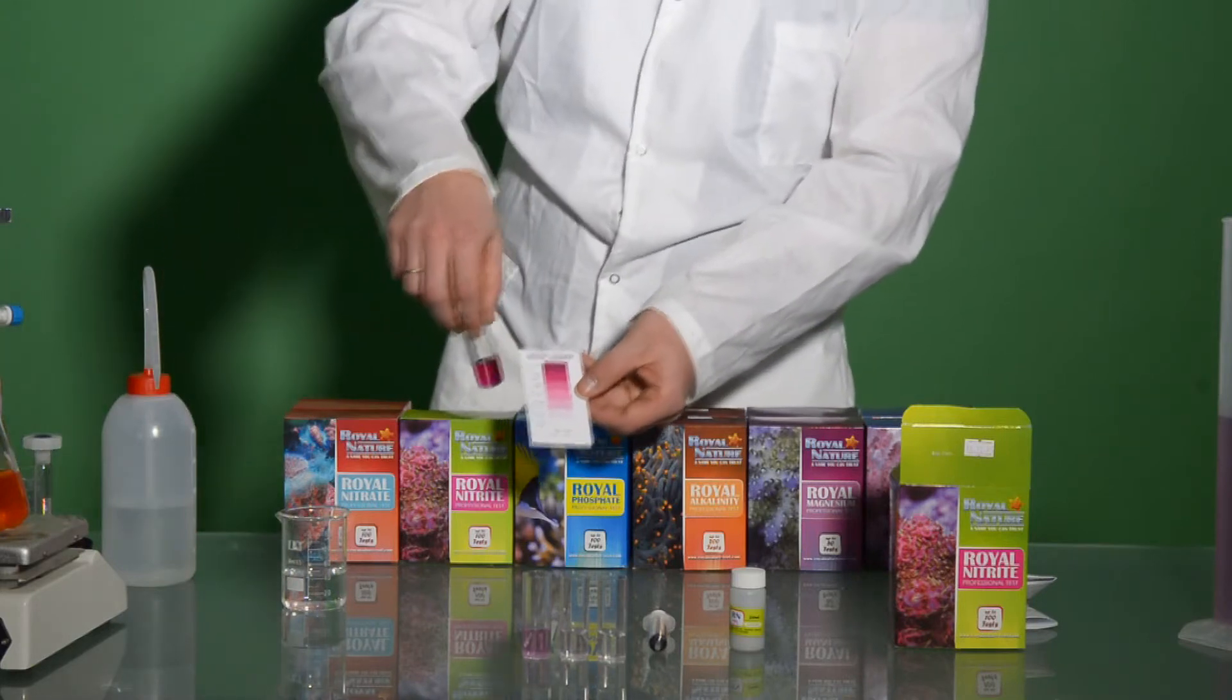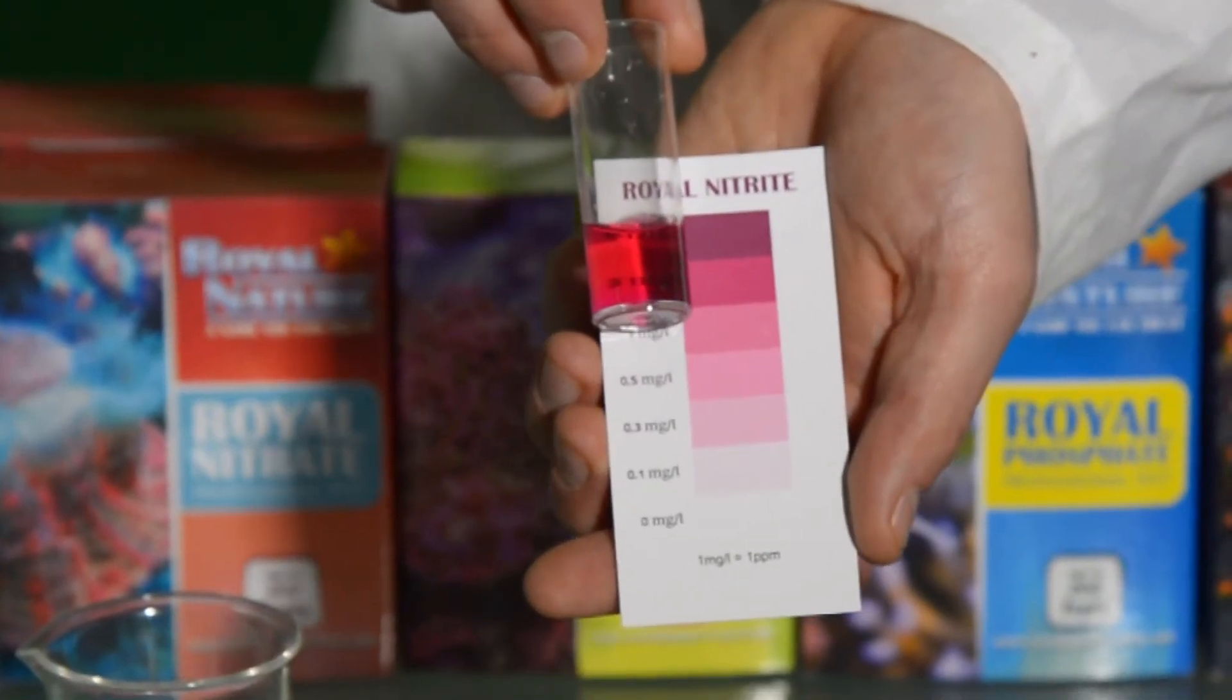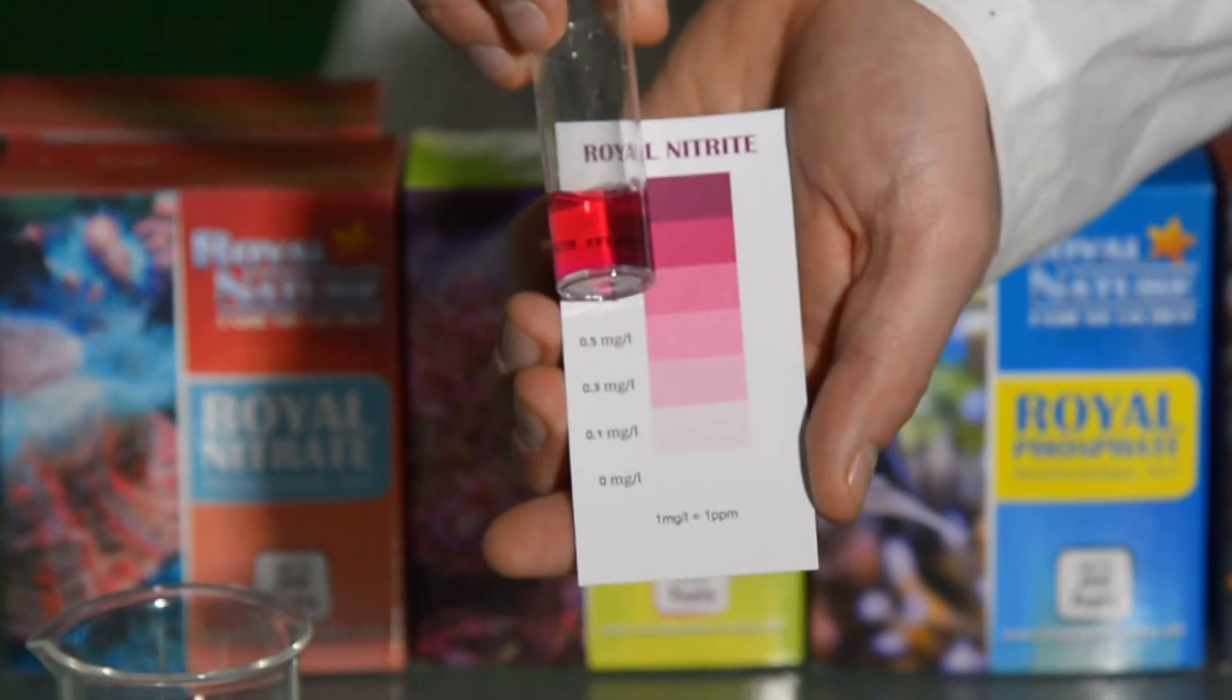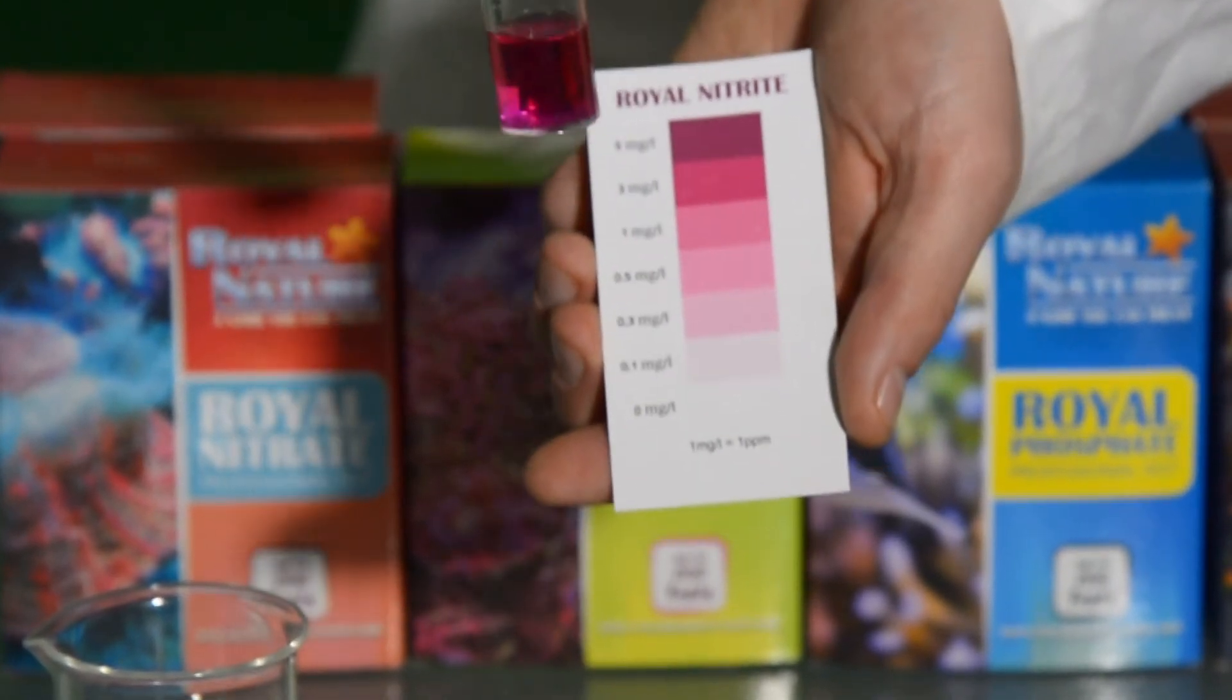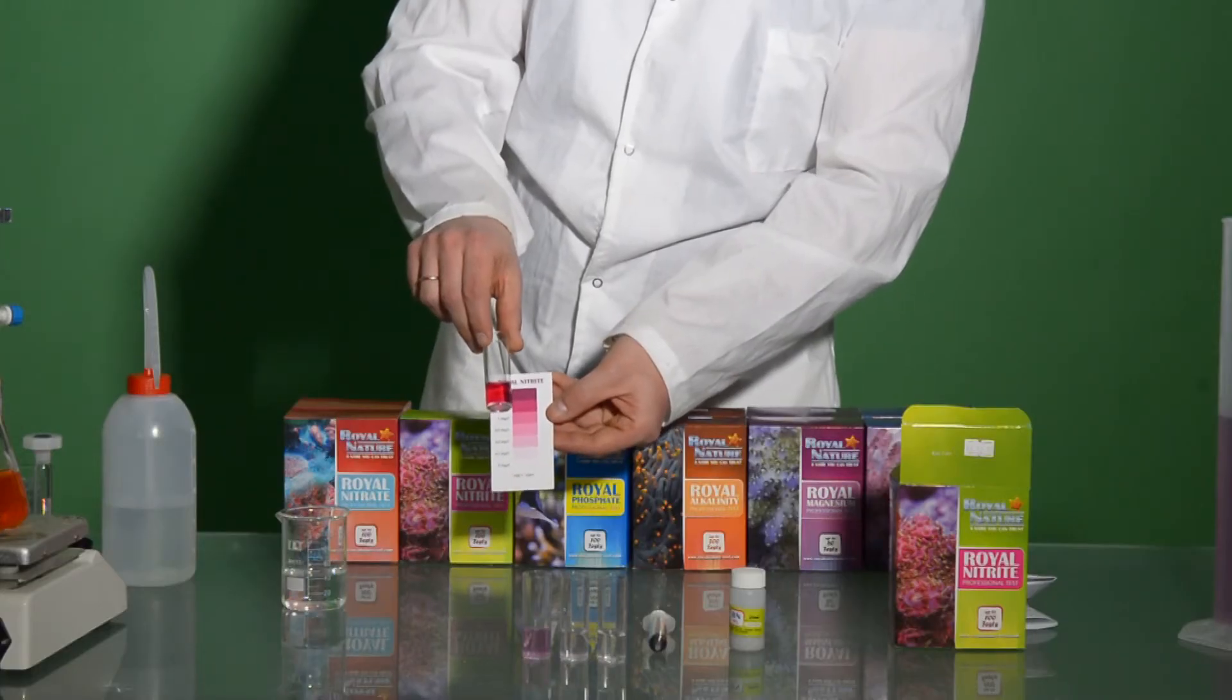The third one is 3ppm. That's a very strong color and you can see that it corresponds to 3ppm in the color chart.